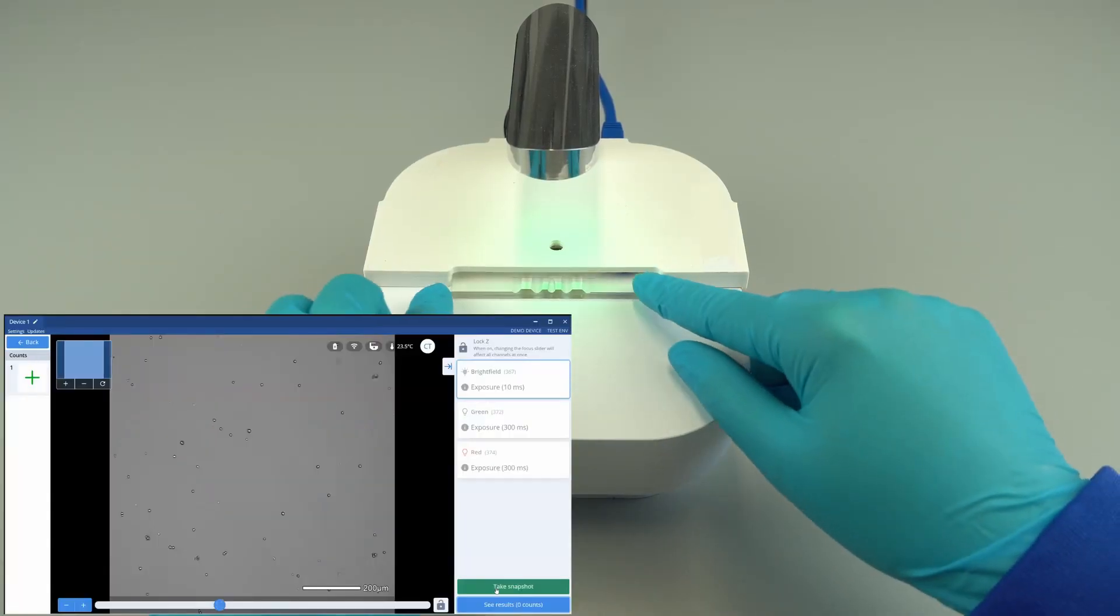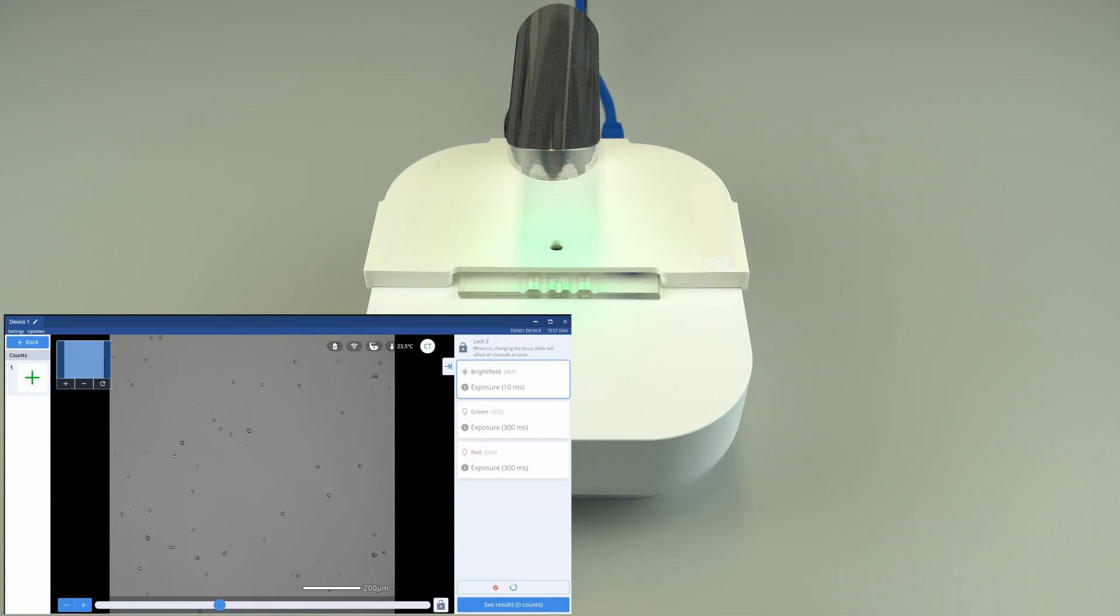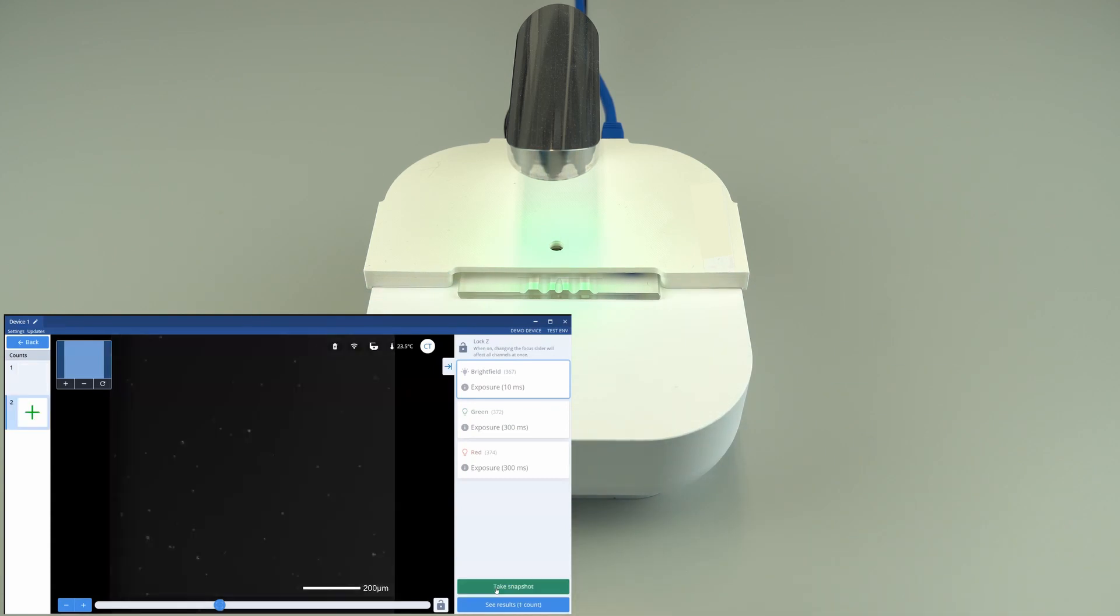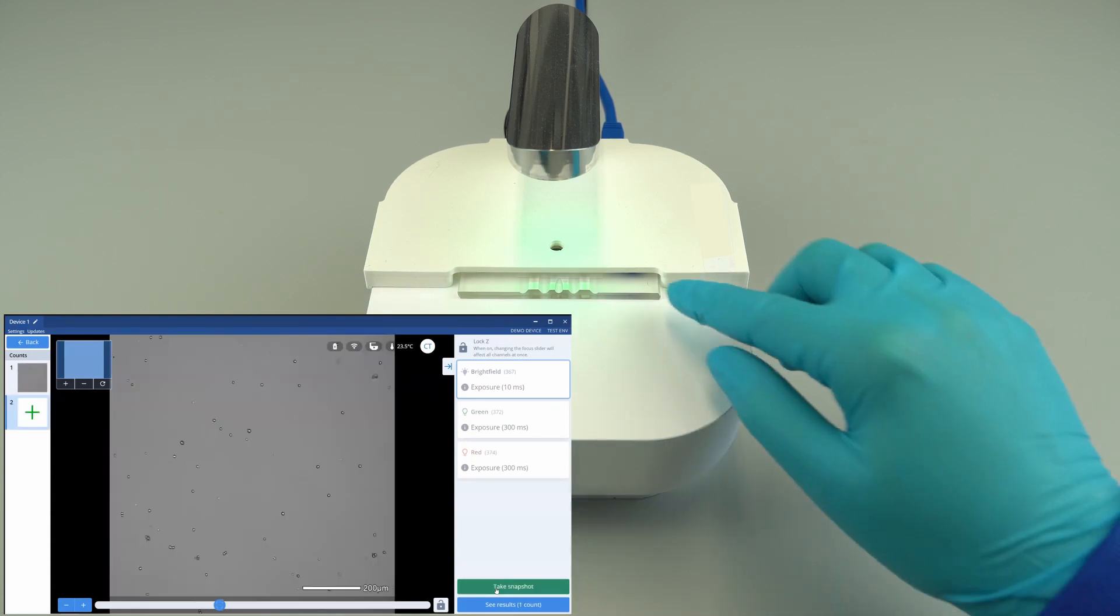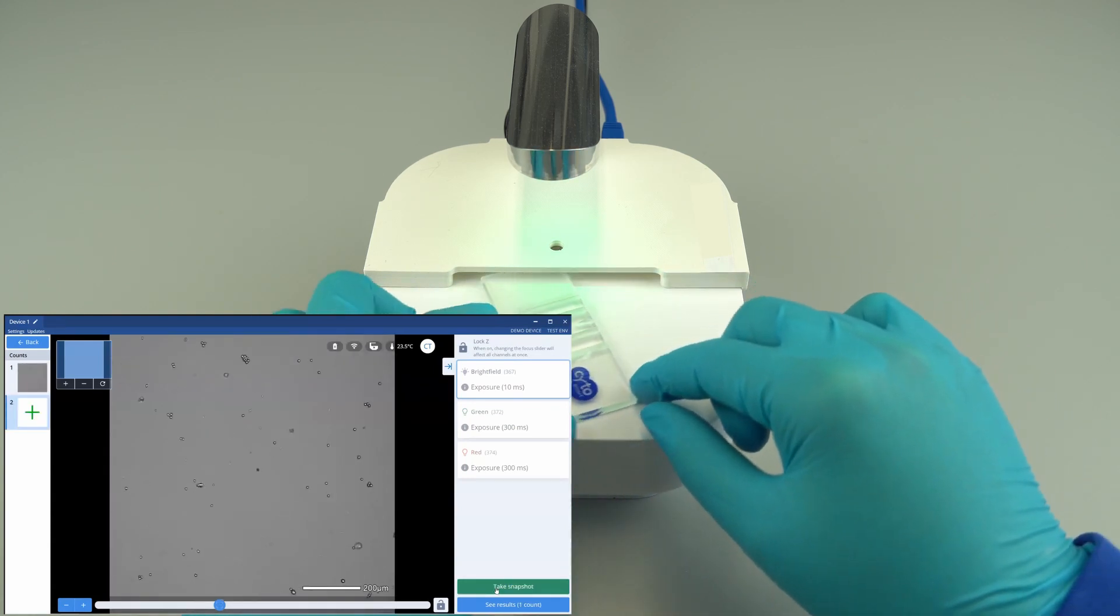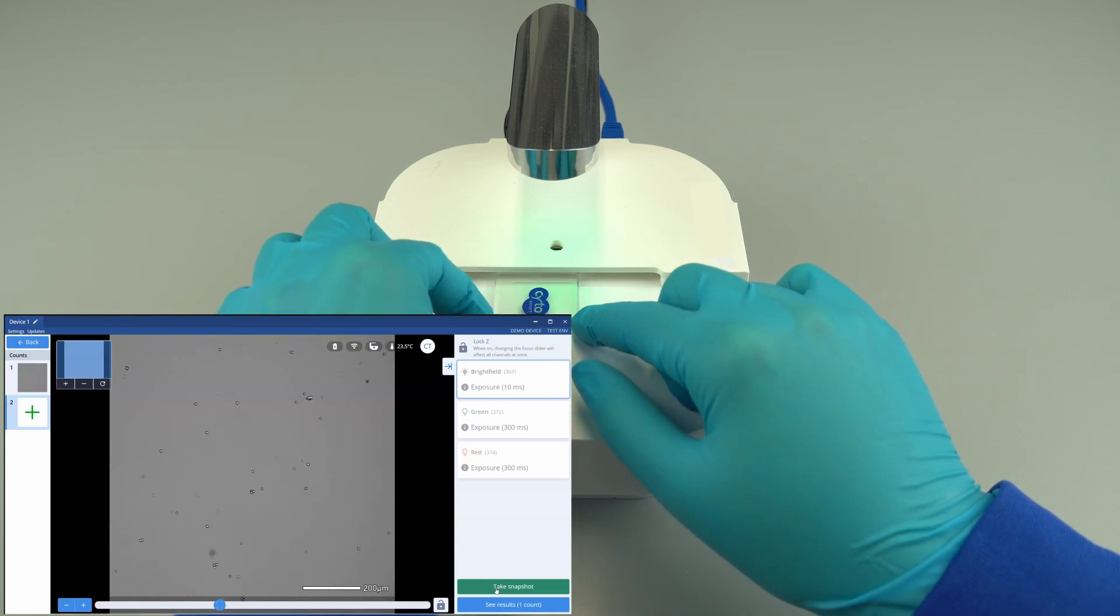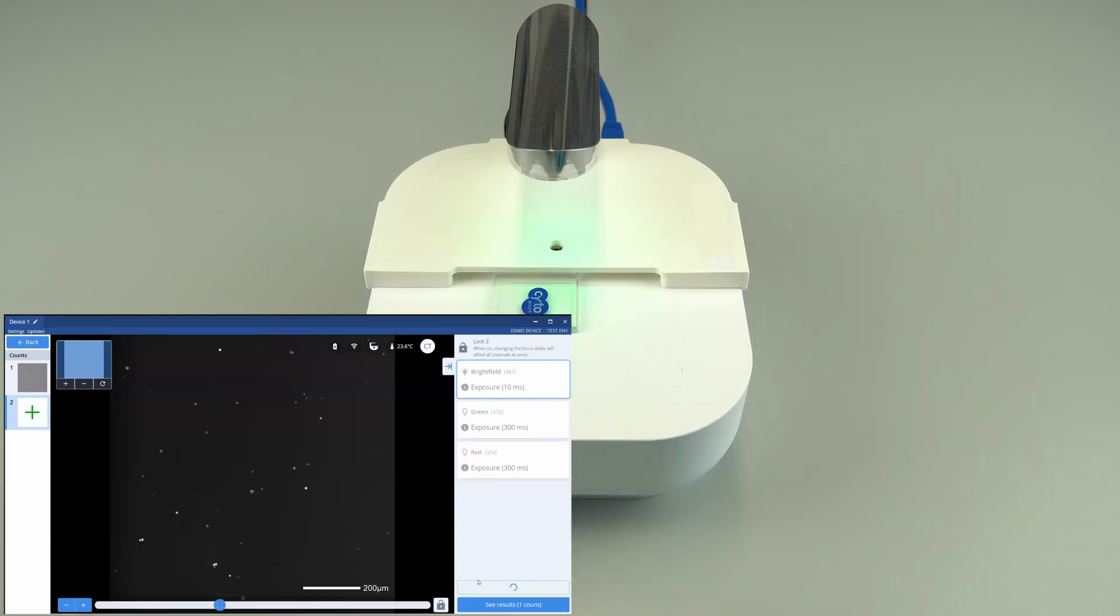The counting adapter allows for eight different locations on the counting slide to be imaged per sample and can be repeated for every sample, offering increased accuracy and precision.